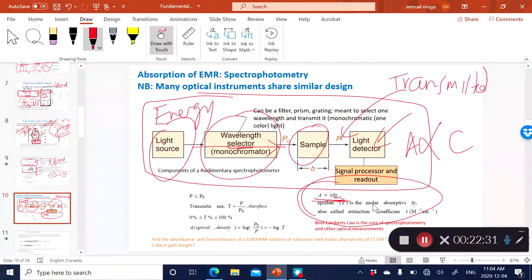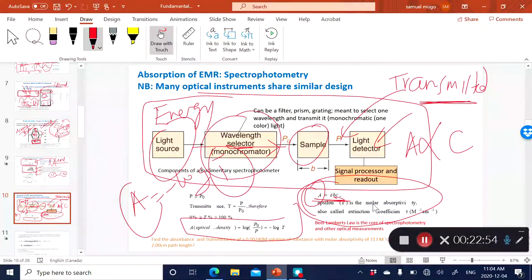As I've said, with spectrometers you are detecting transmitted light, and yet we call it absorbance spectroscopy. So what is the relationship between transmission and absorbance? I think you can see it right here. Absorbance is equal to the negative log of transmittance. So if I know transmittance, I can easily calculate absorbance using that relationship.